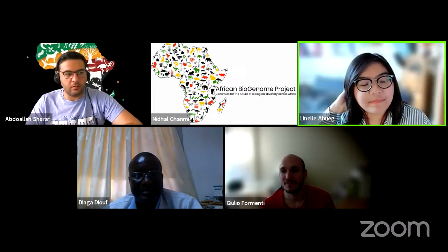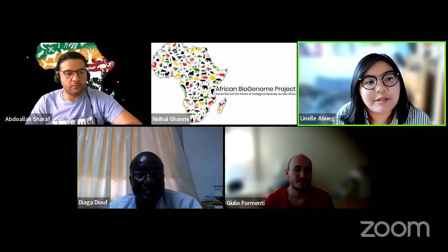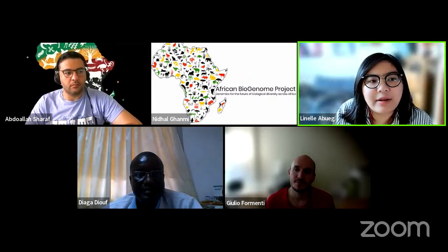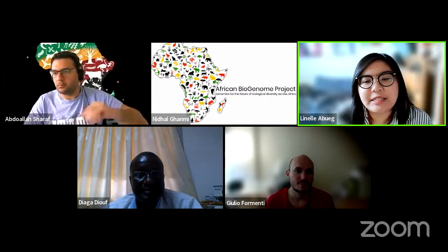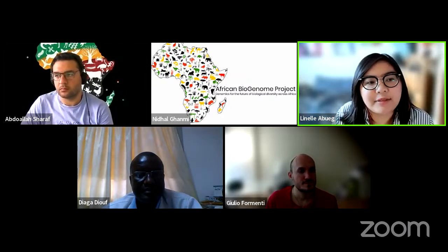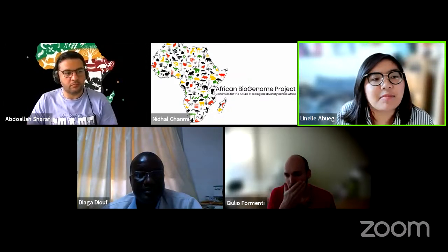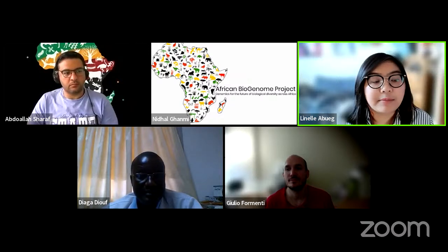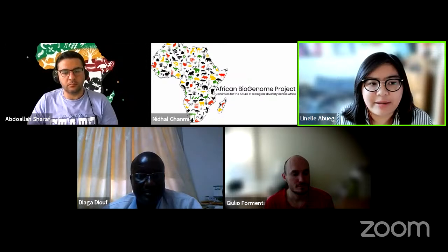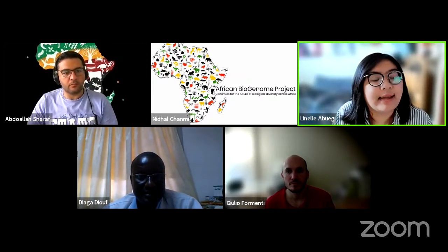No, I was just going to say basically what you had said as well. There's been some people using HiFiASM for polyploid genomes. There's been a tetraploid potato recently published, or available in bioRxiv. And I think for haplotype separation, they had to use offspring data to separate out the actual haplotypes cleanly. But this issue comes up a lot more with plant genomes, so I'd probably look towards labs specializing in that. They'd have a lot more resources or experience about how to make these pipelines fit that sort of data and specimens a lot better.